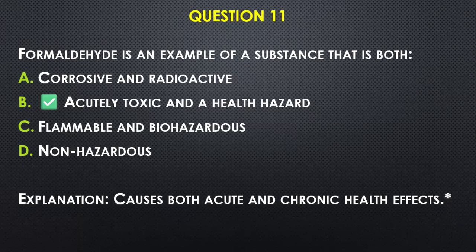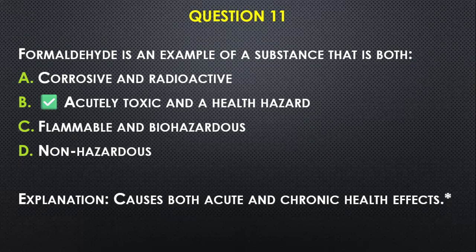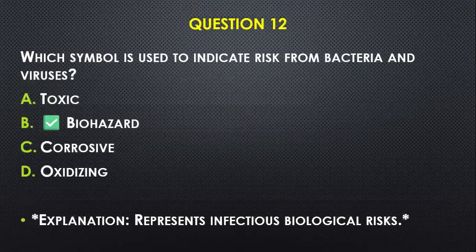Question number eleven: Formaldehyde is an example of a substance that is — A) corrosive and radioactive, B) acutely toxic and a health hazard, C) flammable and biohazardous, D) non-hazardous. I will go with B, because formaldehyde, apart from being a health hazard, is also acutely toxic — it causes both acute and chronic health effects.